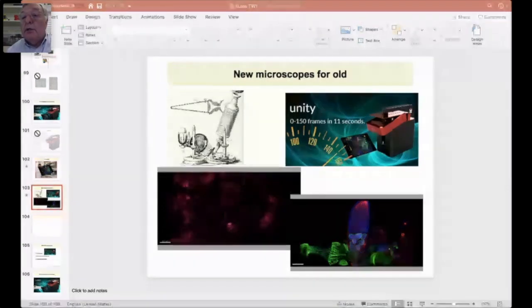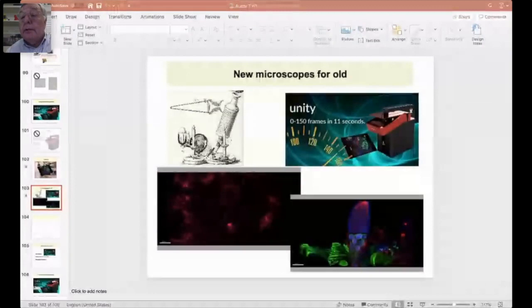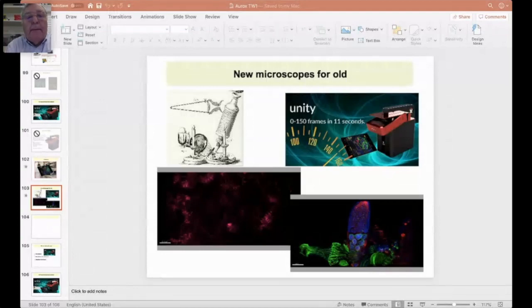Yes, I actually had a lecture on this. I have nothing but the highest regard for Petran and Hadravsky. What Petran did was really quite remarkable. When he first built his microscope, the question is, what did he use for a light source? Because quite clearly there was no laser or anything. A candle, perchance? Well, sort of. A rather well-known candle called the Moon, or rather called the Sun. He took the microscope up into the High Tatras Mountains and used the Sun as the light source.